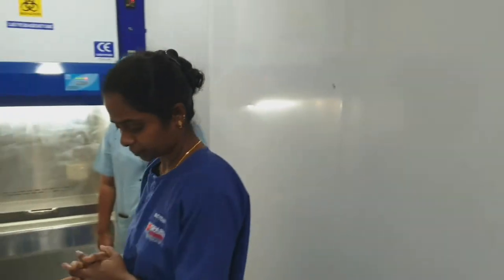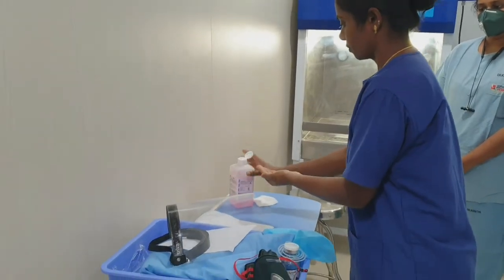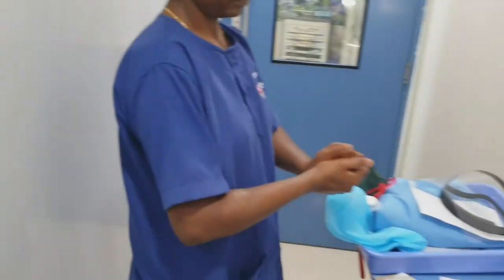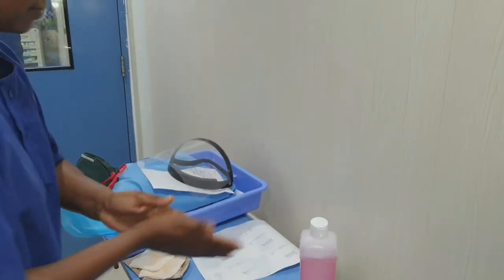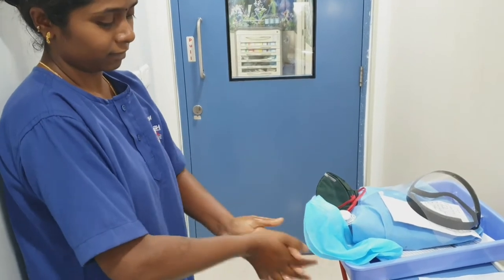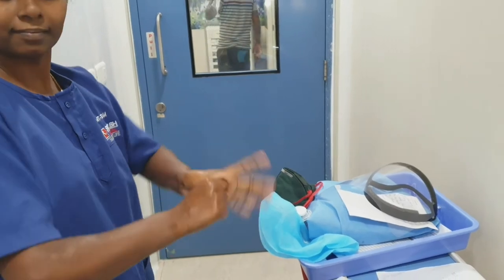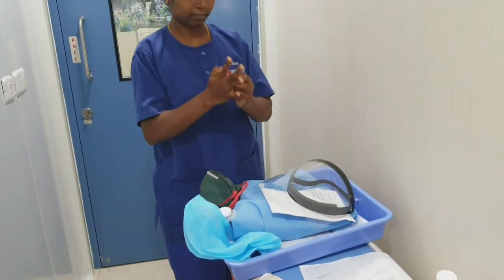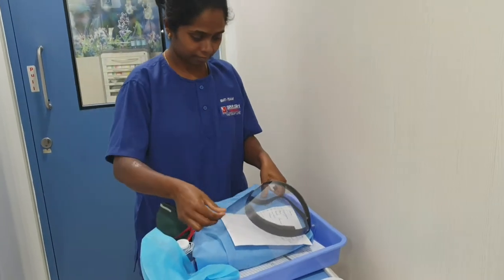She has done the hand washing and now she is going to wear personal protective equipment. This is 2% chlorhexidine — just sanitize the hands. If you have done hand washing outside, come in and sanitize your hands with 2% chlorhexidine. Follow all the hand washing techniques even for the sanitizer.